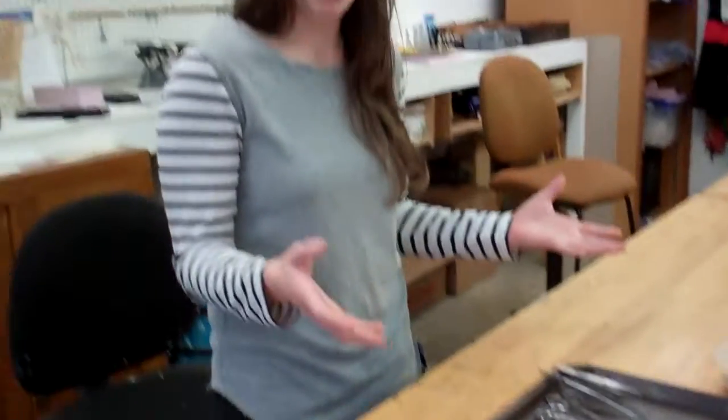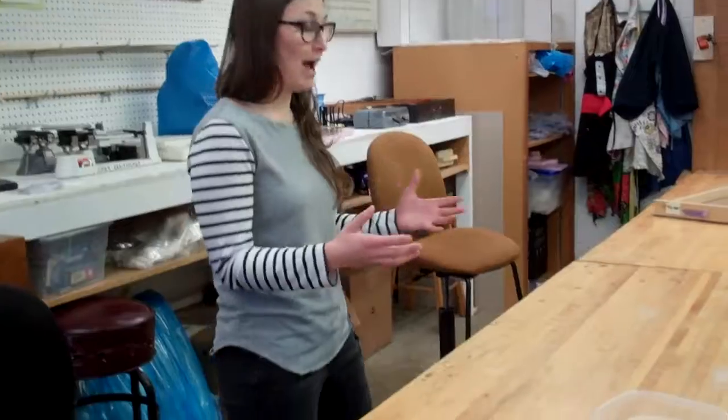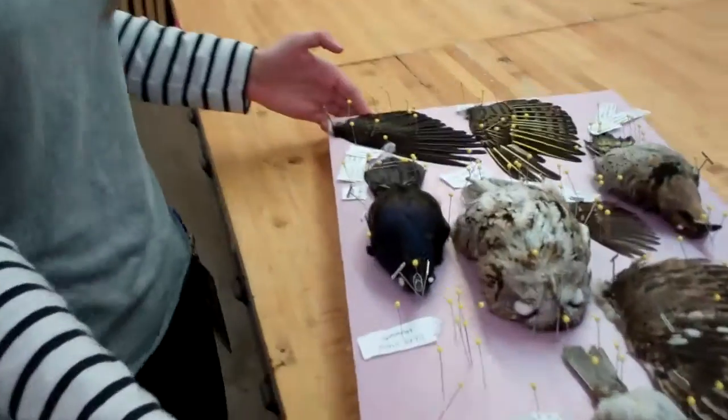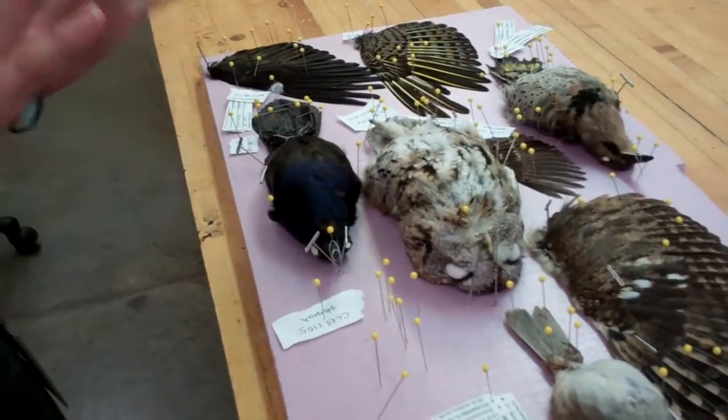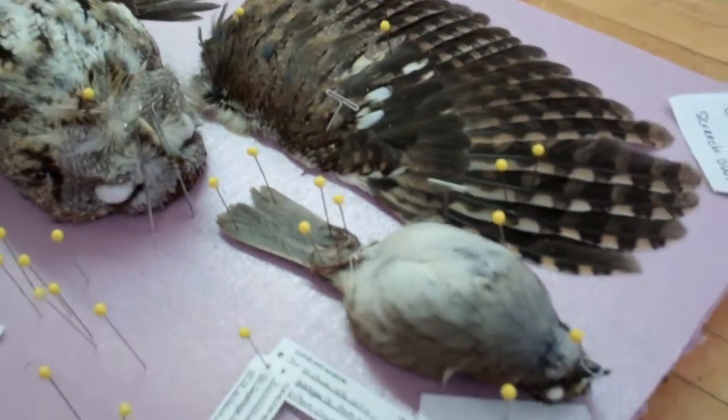Once the birds are prepared and we're happy with how they look, you pin them to foam boards and we pin them in the position we want them to stay in. Bird skin is so thin that it just air dries - we don't need to use any harsh chemicals to dry them out.